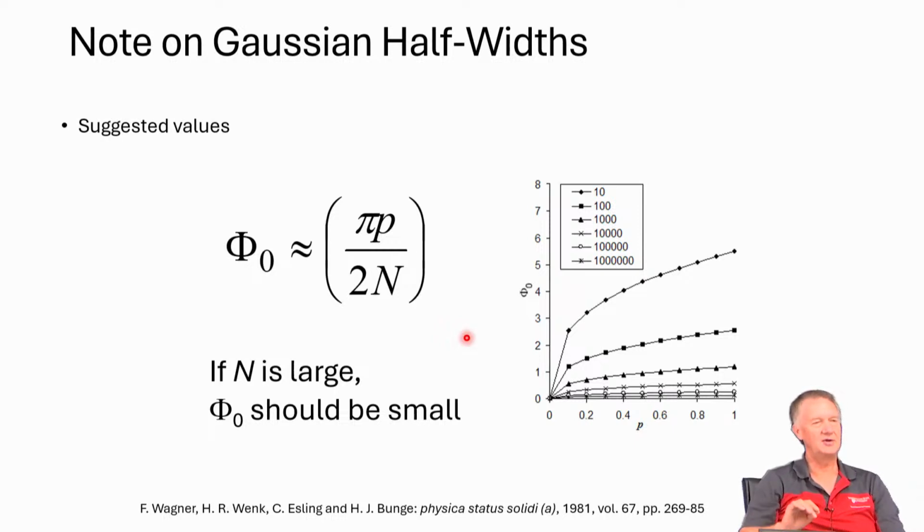If it's more like 100 grains or 1,000 grains or something like that, then sometimes I'll use the default value just to kind of smooth things out a little more. And I do the same thing if I'm doing X-ray measurements or if I'm doing the generalized spherical harmonic: I'll use a lower truncation value if I have less data.